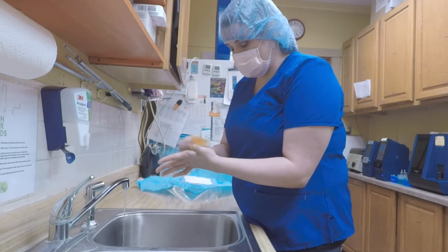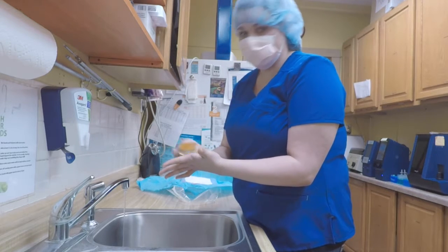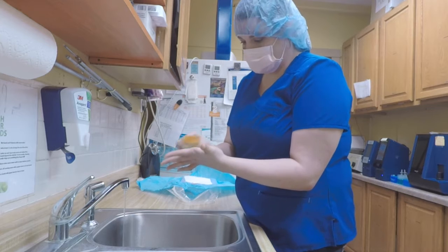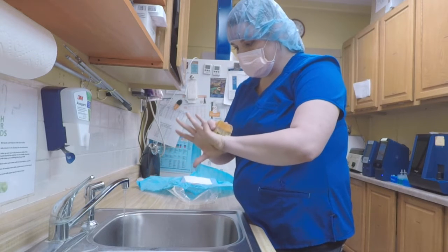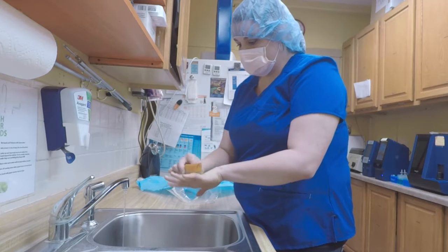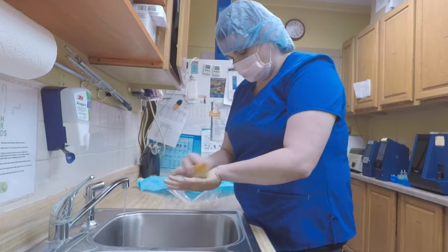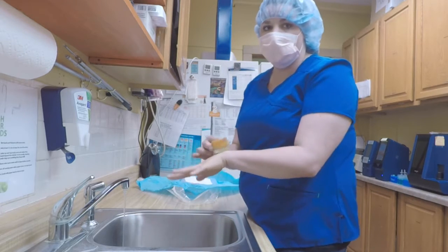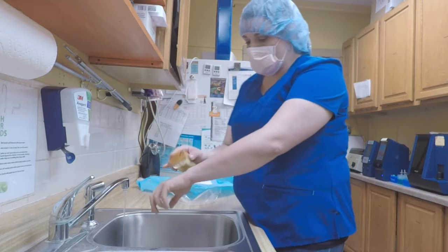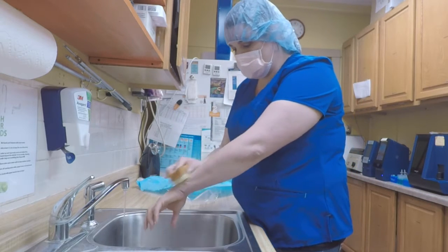You want to do that 10 times as well. And then move to the back of your hand. And then once you've done the back of your hand, you're going to do your arm to your elbow, and you're going to do one side first and then move to the other side.